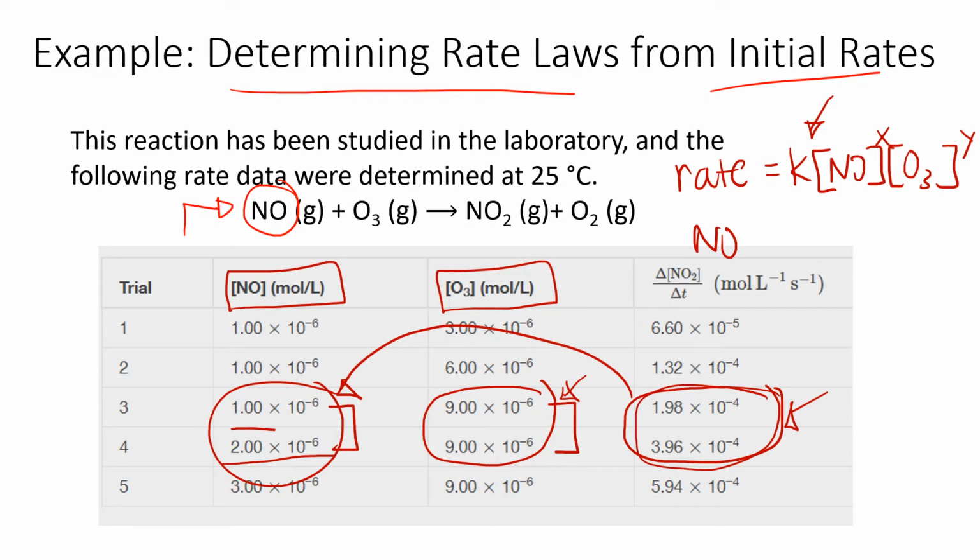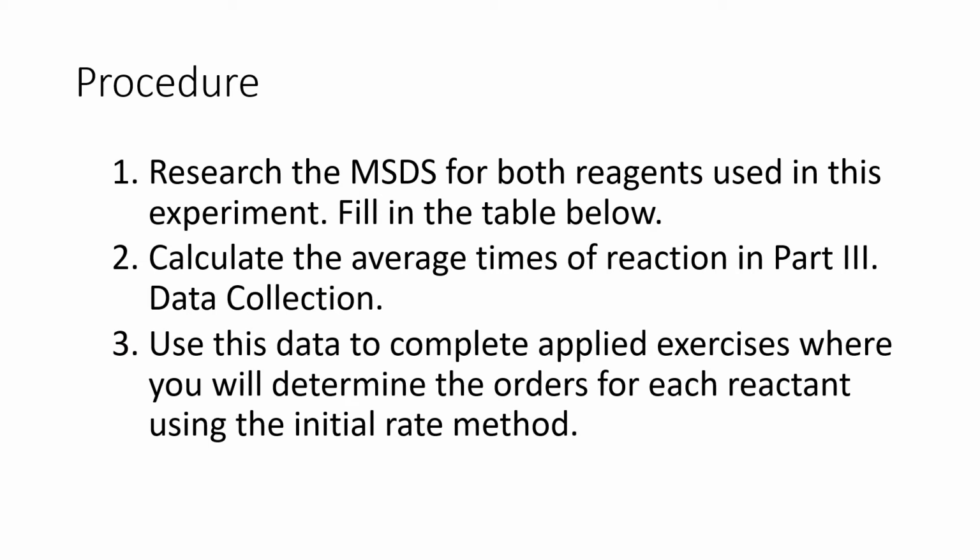For the steps on how to actually calculate this out. This was more just kind of getting your brain primed for working these problems out, all right? Okay, so now that you have all that background info and you're a little bit more prepped on how to approach all of this information in this lab, this is the procedure.